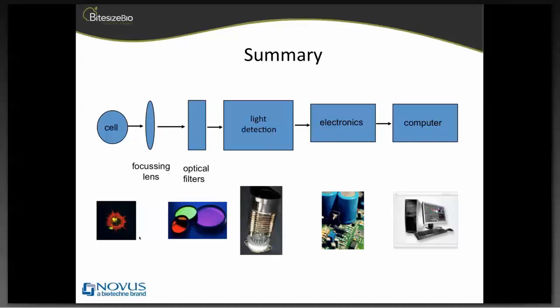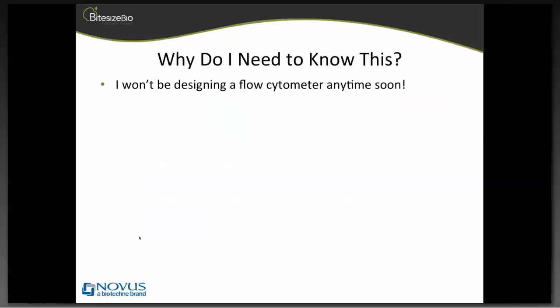Would you like to know about compensation? The question is just regarding compensation. Can you briefly explain spectral spillover? I'll just go back a few slides and I will show you some things.